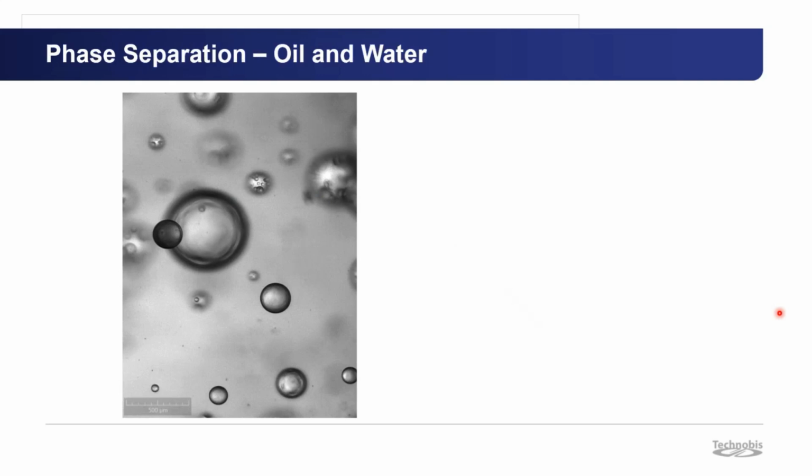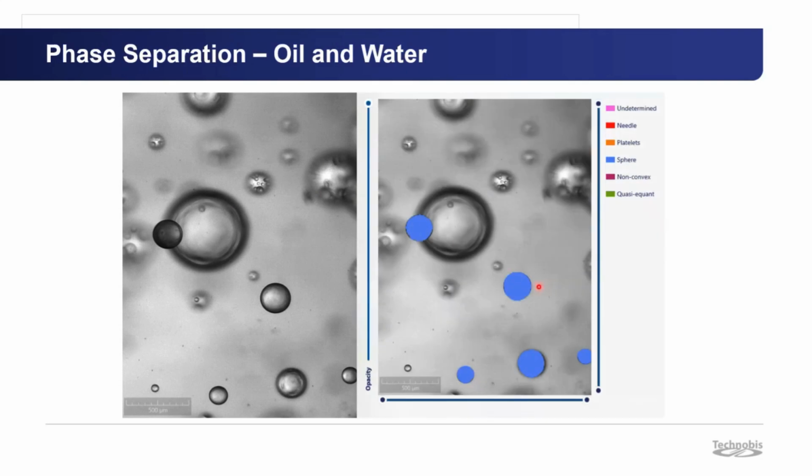And then using that, we can detect objects. So this is an oil and water case, and we can detect our oil droplets as spherical particles.